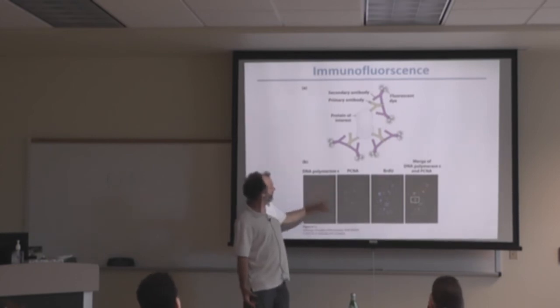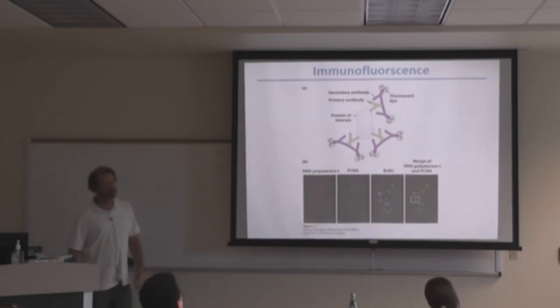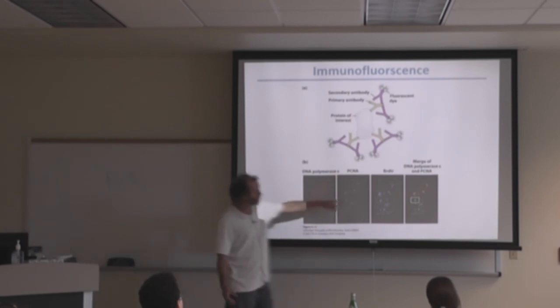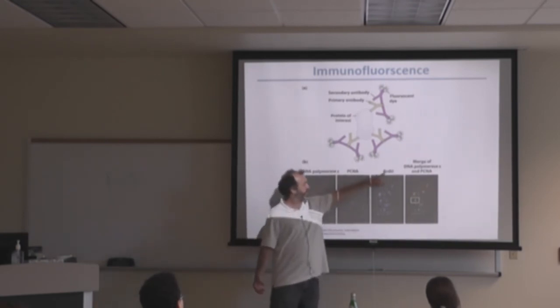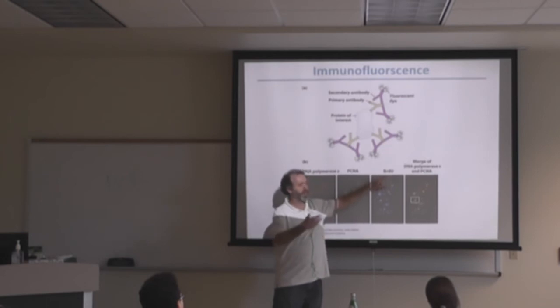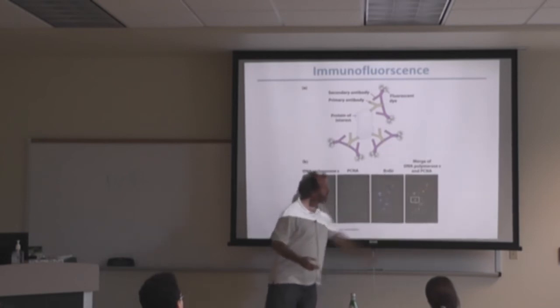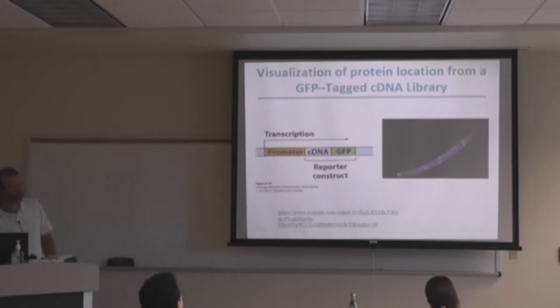So DNA polymerase is found near PCNA, and BrdU gets incorporated in the copying DNA. It has a bromine on a dU, so it's an analog that gets incorporated in the DNA that's copying, and then you can have an antibody directed towards that. If you look, they're all merged together in that cell. That's why you look at different colors; you can see that they're co-localized.